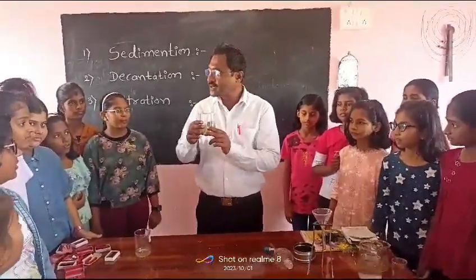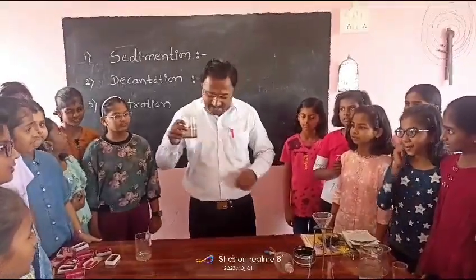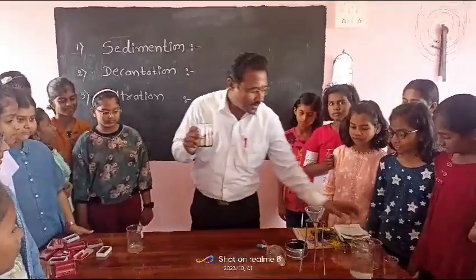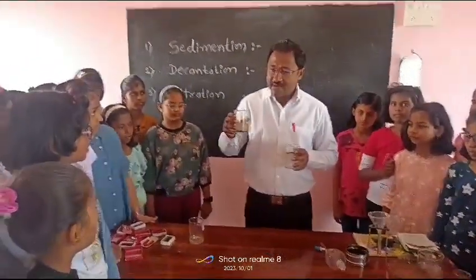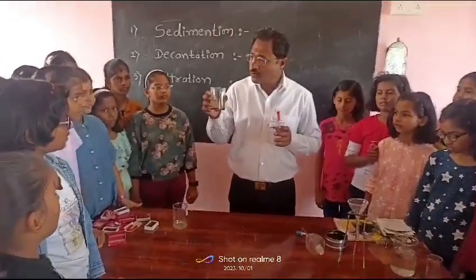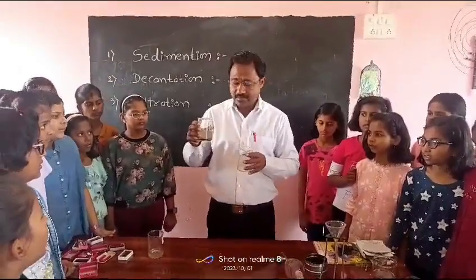Now, after sedimentation, which process is followed? Decantation. For decantation, I take another beaker and pour this water, or this mixture, without disturbing the sediment.